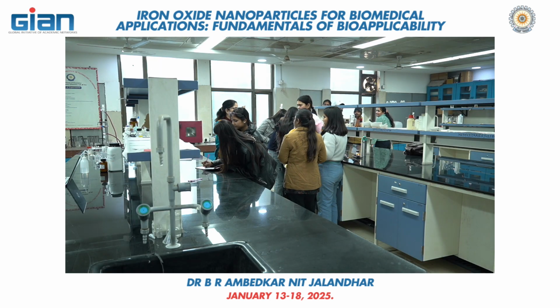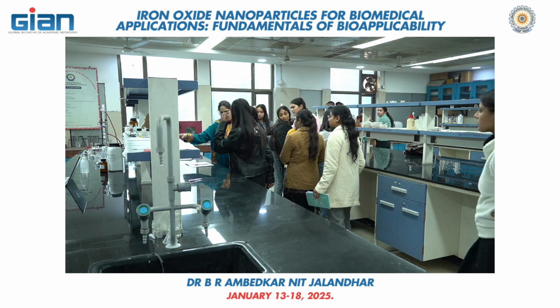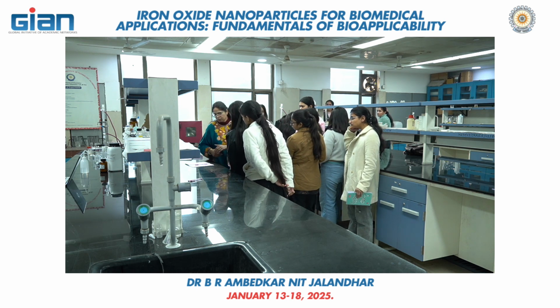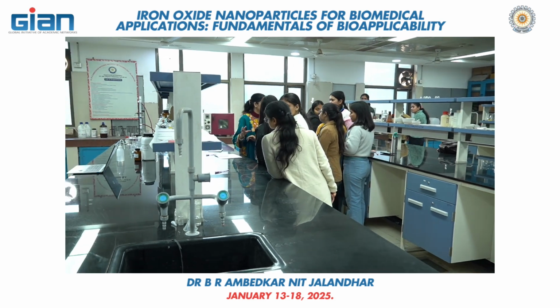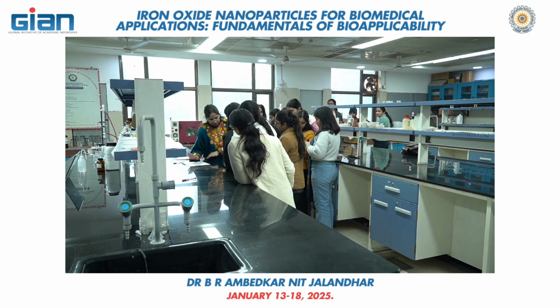So you can keep the sample and store it, or you can submit it to our team. So on the last tutorial you will use these samples for the removal of this silver and the gold from the aqua solution. So now we will remove the heavy metal by means of the iron oxide. So this one is 395 and 560.